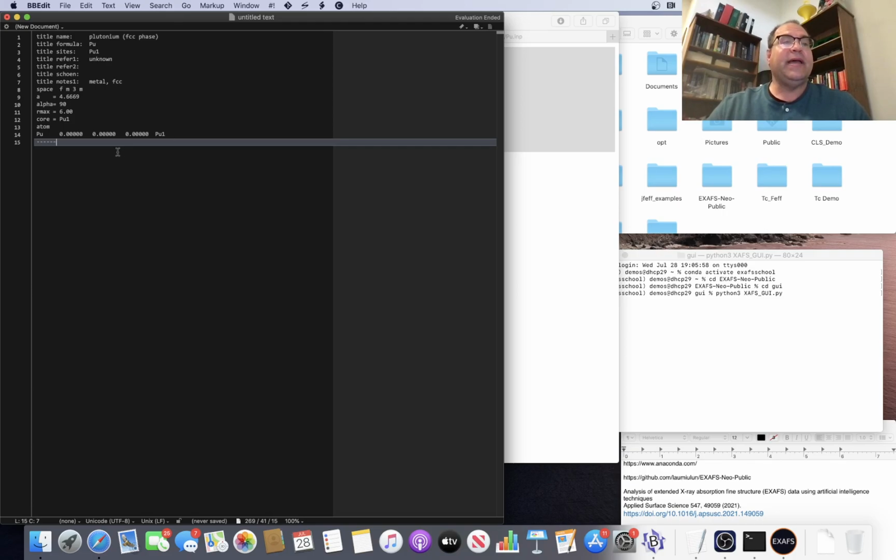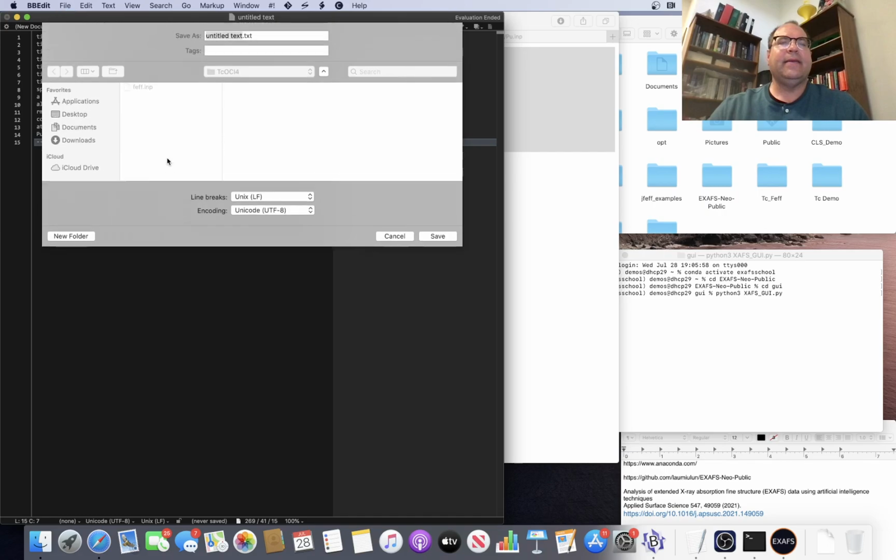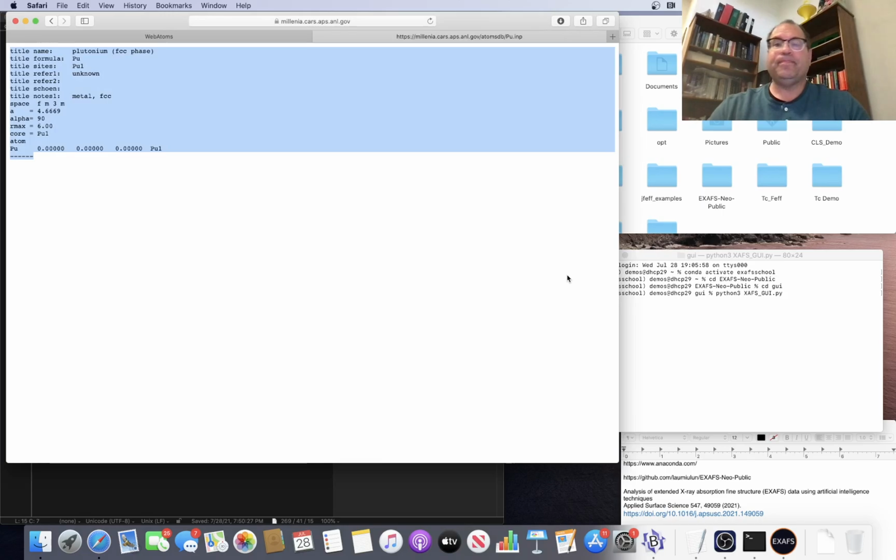And then I could go ahead and save this as atoms.inp, and replace the old one.